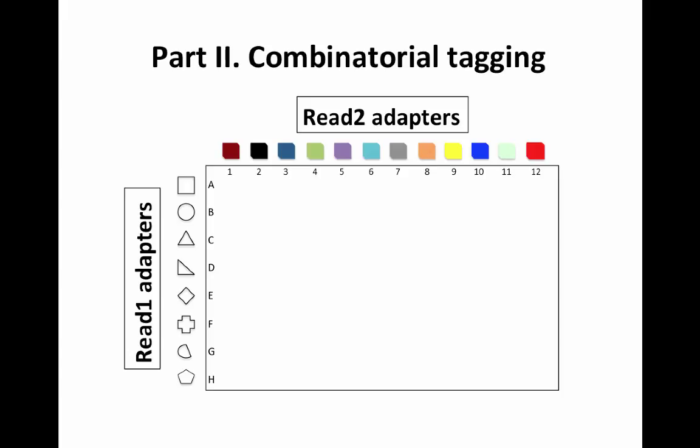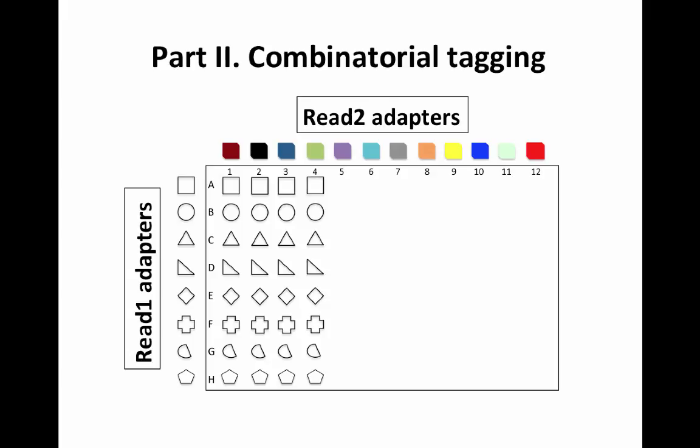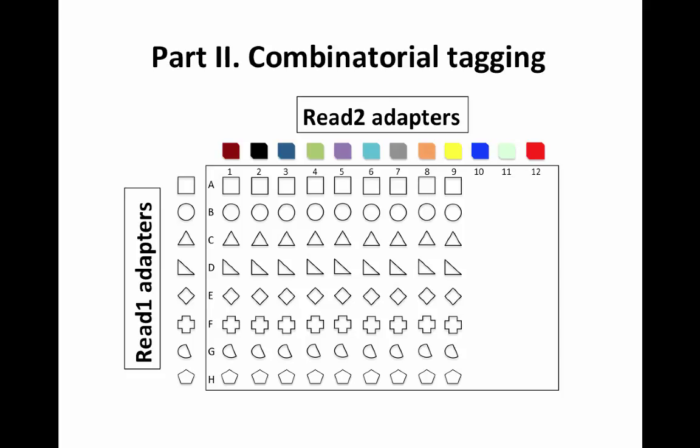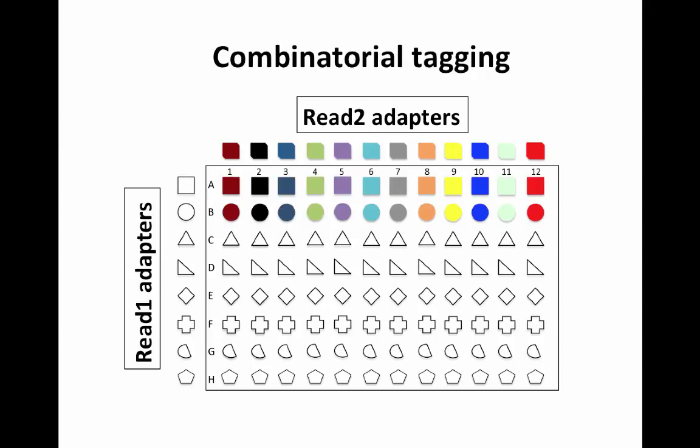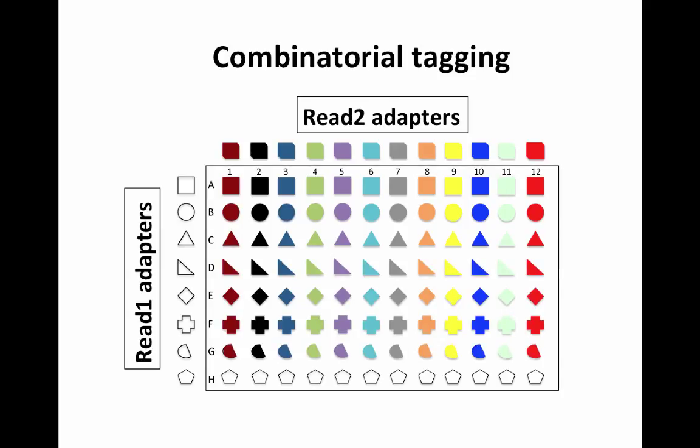Typically we have the READ1 and READ2 adapters in strip tubes that are stored in a strip tube plate. After we have everything in place and prior to pipetting into the 96-well plate, be sure to mix the READ1 adapters well in the strip tube by pipetting up and down multiple times. Then we use a multi-channel pipette to pipette READ1 adapters to each well of the 96-well plate. This requires pipetting twelve times. Now we are ready to repeat that process for the READ2 adapters. Use a 12-channel pipette to pipette the READ2 adapters into each well. Now we have unique combinations of READ1 and READ2 adapters in each well.